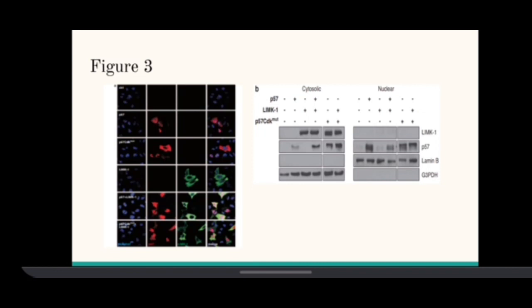In figure A and B, the HeLa cells were transfected with the expression vector, and they were transfected for 24 hours. This figure shows the fixed and stained cells. Antibodies were specifically used to see if the MYC immunotagged LIMK1 was present. The nuclei were also stained just to be able to differentiate the cells.